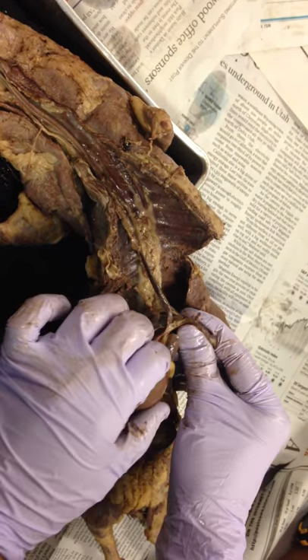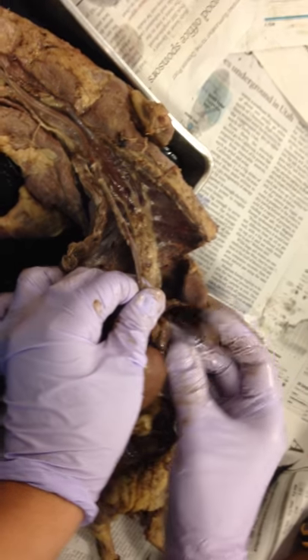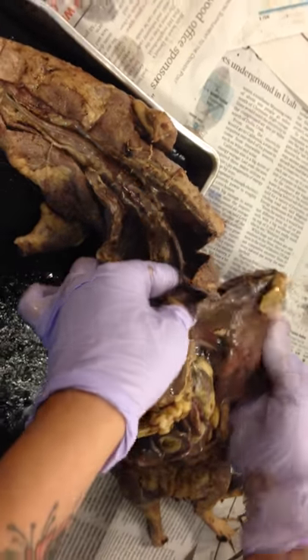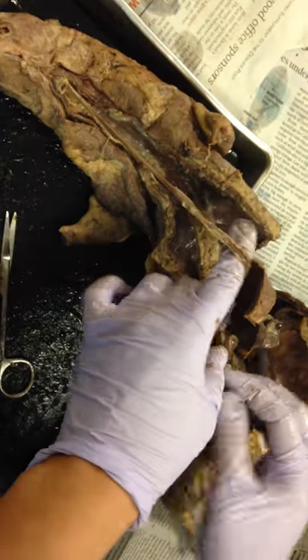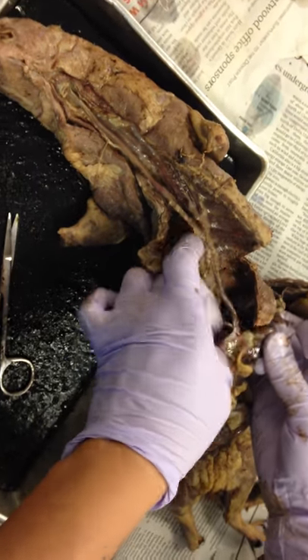Now I can put my scissors aside, and there's some more connective tissue in there, and I can just wiggle that with my fingers. Now I can see, okay, again, here's all my diaphragm. See all of it? That's now off to the side, and now I can see my esophagus is going to directly connect to my stomach. And I've got more connective tissue in there too.